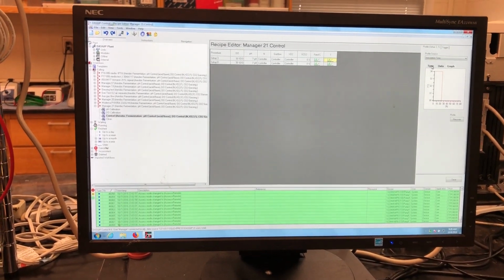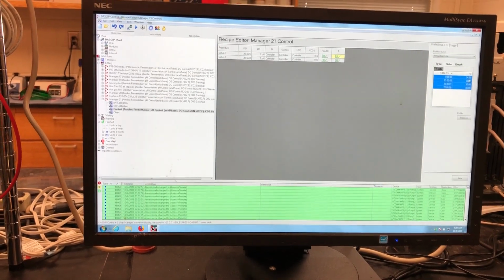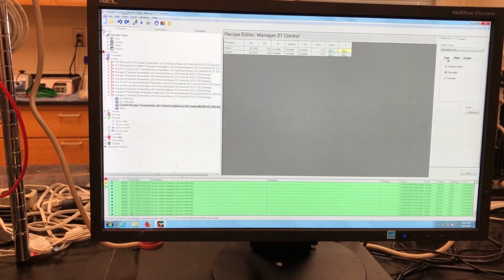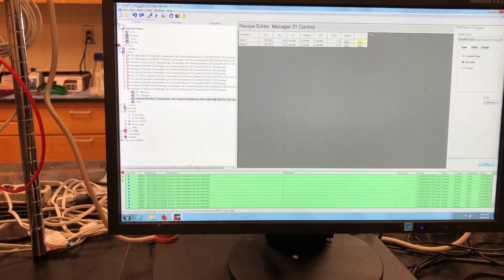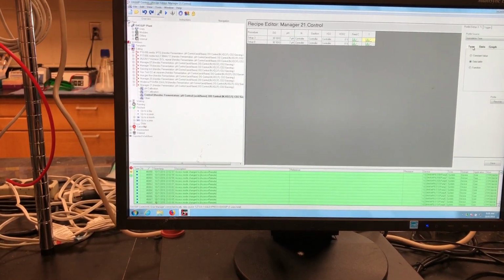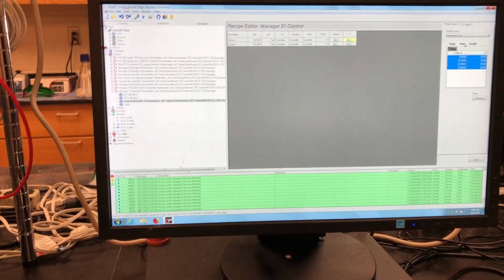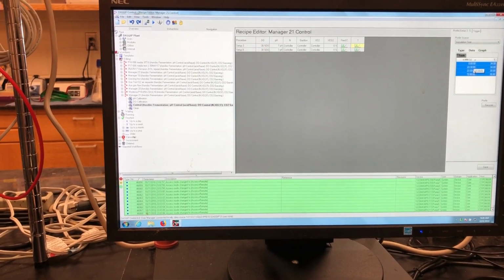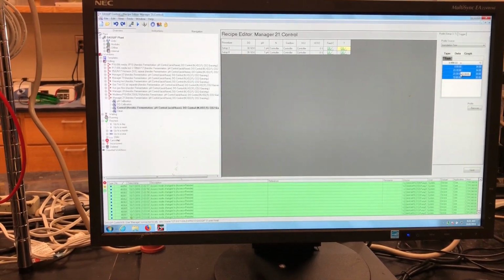Here's the temperature. We actually have a temperature for this run where it switches partway through, goes from a higher temperature to a lower temperature, but likewise you can change that to whatever you want as well. All right. And what's the trigger for temperature? For the time component? It's also just time currently. So it's not looking at induction, or you're not inducing anything in this case? In this case, it just has a set induction time at 24 hours, and so a little bit before 24 hours, it will start to cool down to a lower temperature for induction.